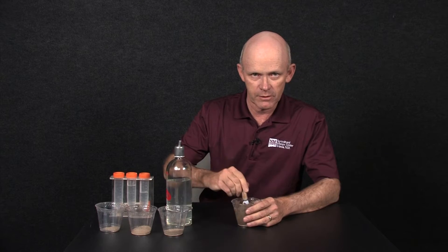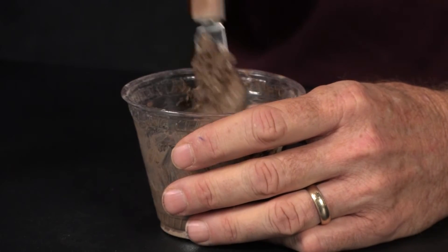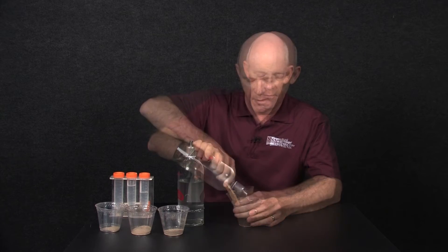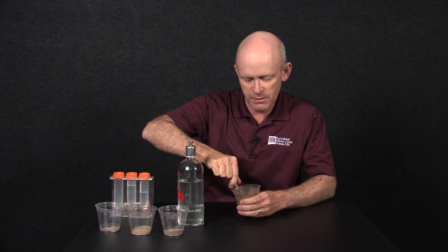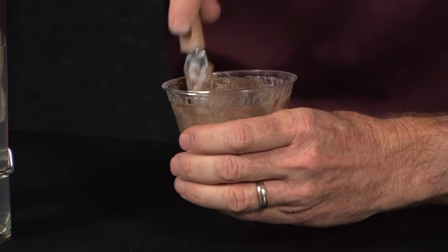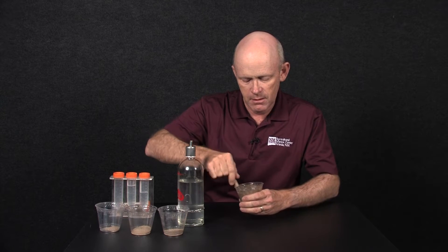It also gives us enough liquid to extract in order to test how much salt is in the soil. Now, labs don't typically like this procedure because it takes more time to do it, and when you're running thousands of samples a day, there's no time.